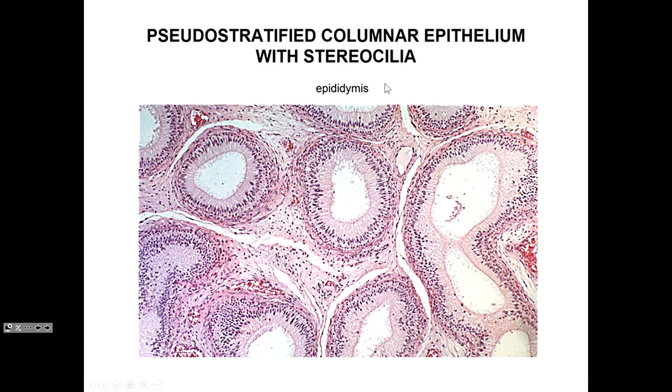Stereocilia. Okay, you don't see them very often. Epididymis is a good location in the male reproductive tract. This is a low power view of the stereocilia. You can see how long they are. Basically, they're long, skinny microvilli, and because they're so long and skinny, they tend to goop together. So you see little tufts of them, sometimes. That's probably 20 different stereocilia there that have gooped together.